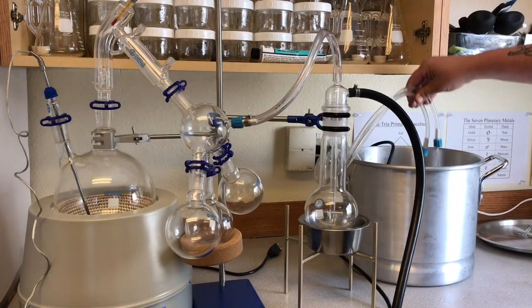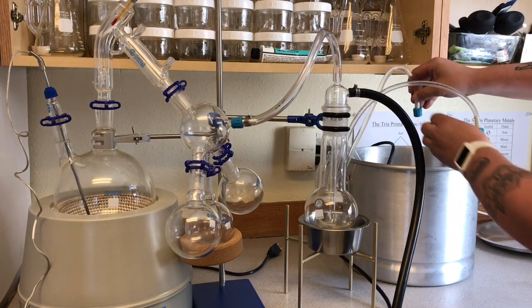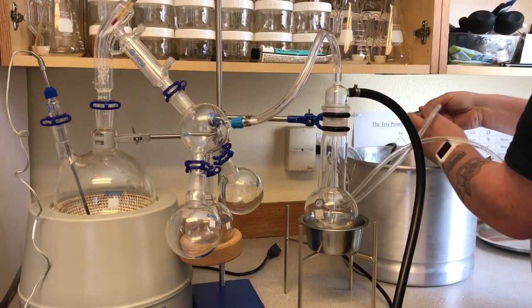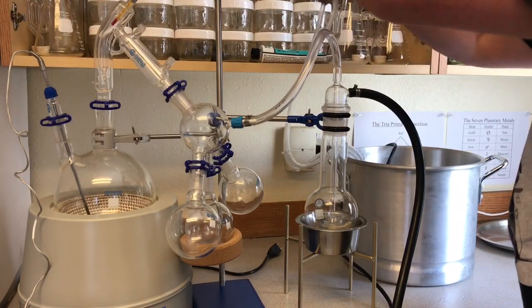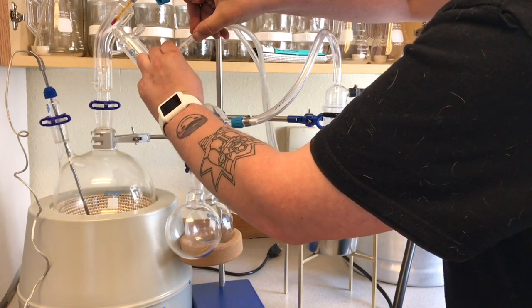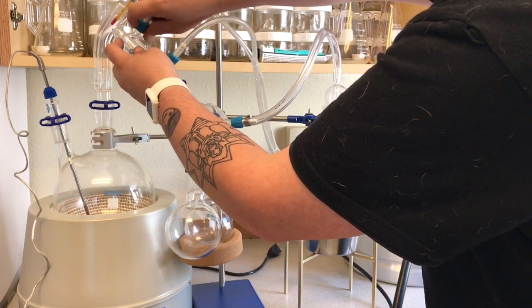So I've got my pump plugged in, and I can see that it is this one that is pumping out. So I can go ahead and unplug this for just a second. I've got the one that's pumping out, and this guy will connect here. And you always want the water in to start down at the bottom, and you want the water out to be up here at the top, like in all the diagrams that you'll see.